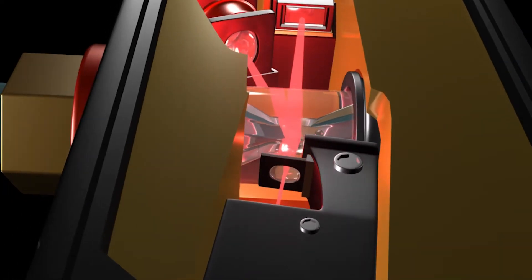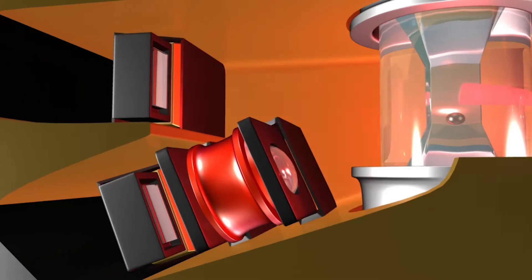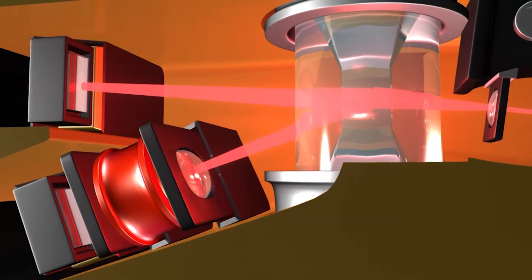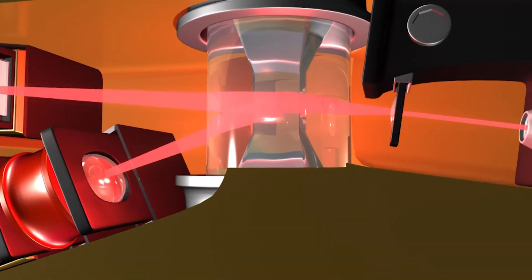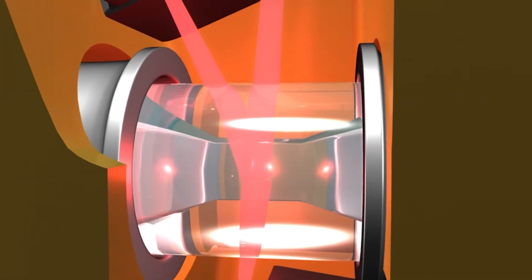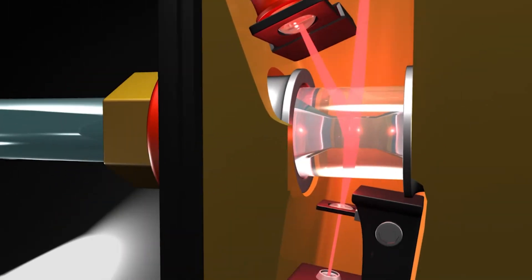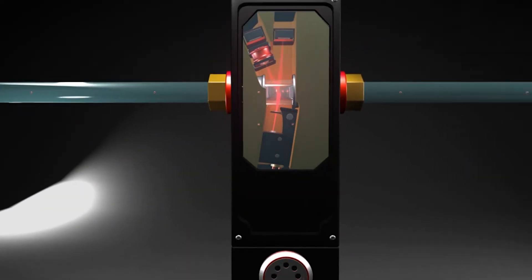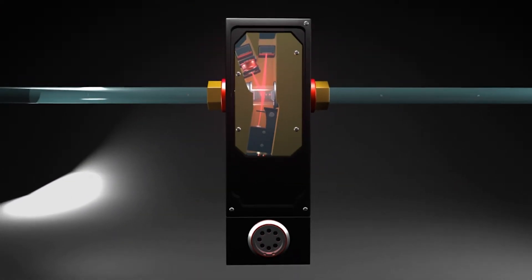Both extinction and scattering detectors generate pulses proportional to the size of the particle. A pulse height analyzer converts these pulses into a particle size through the use of a calibration curve. The results generated include the particle size distribution and the concentration in particles per milliliter.